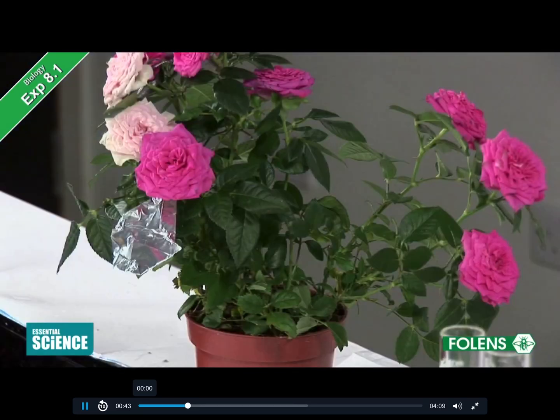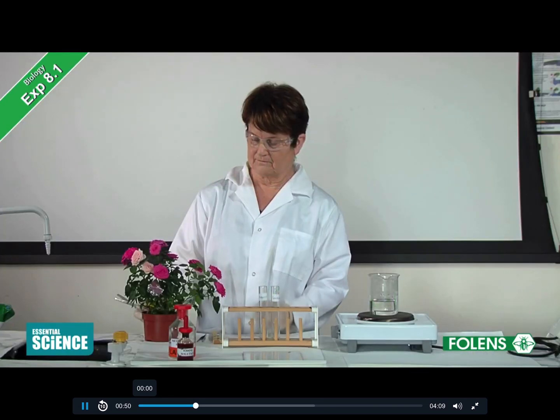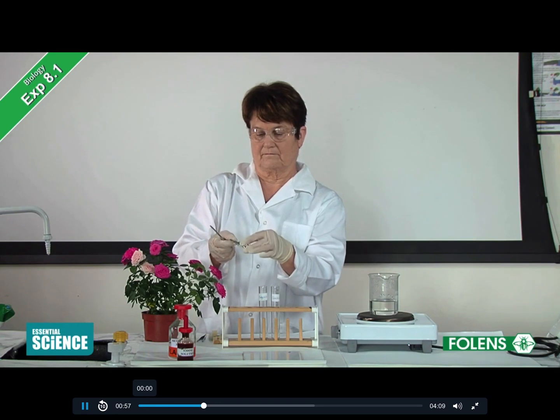The plant was then exposed to strong light for 6 hours. We are now going to take one of the leaves that has been covered with aluminium foil and one of the exposed leaves and test both leaves for the presence of starch. A covered leaf is removed gently from the plant.